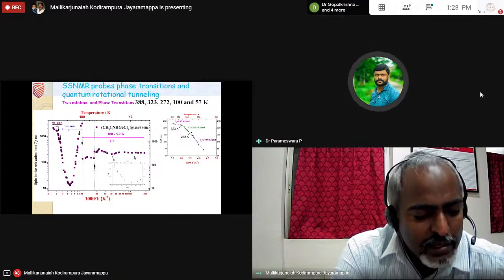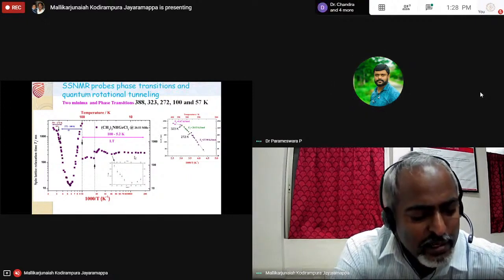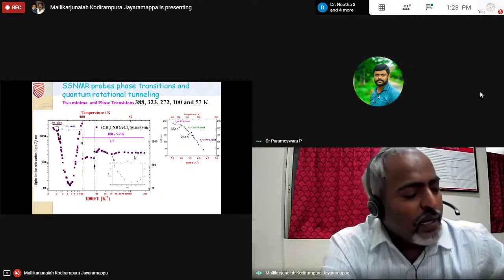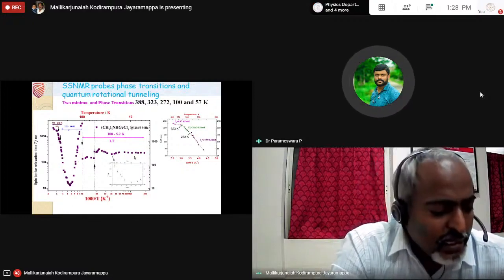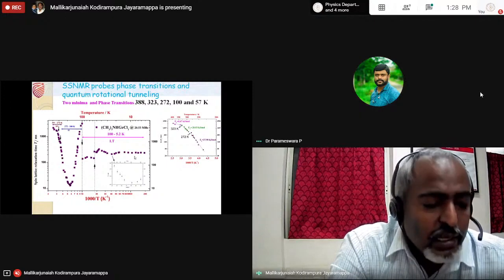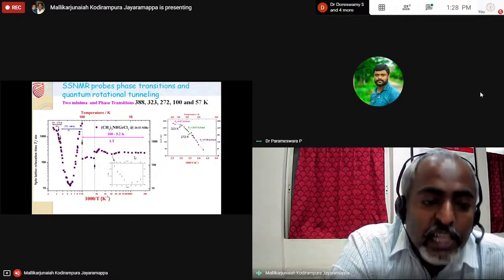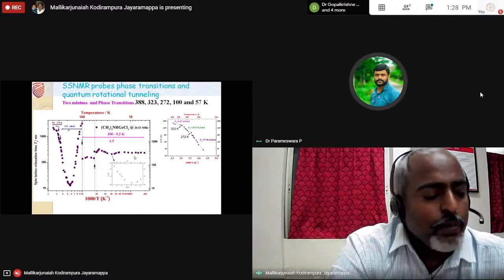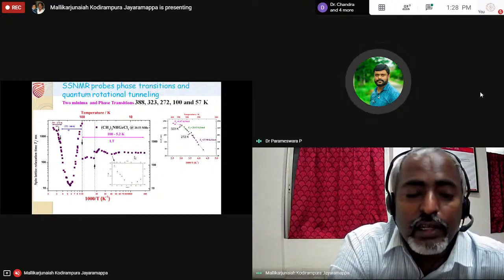Is there any experimental proof that the internal field in bulk iron is 33 Tesla? You have mentioned it in one slide. Yes, bulk iron. Did I mention iron over there? You mentioned 33 Tesla. Yes, that is very well established, because we ourselves have performed several experiments. Probably he might be asking how they measured this 33 Tesla, the particular technique maybe.